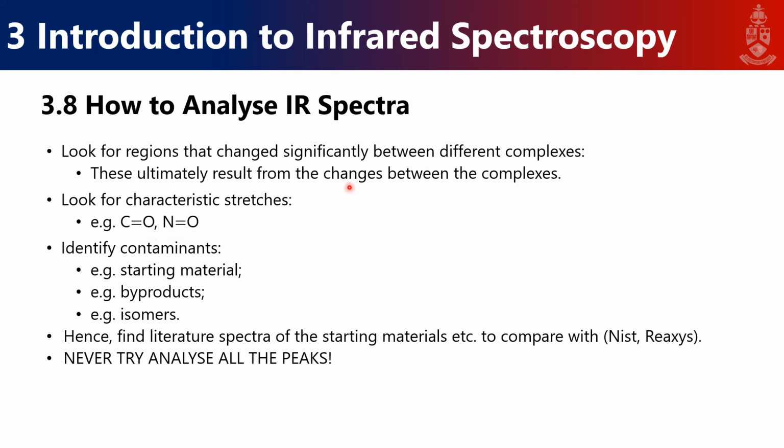You're looking for the differences, which you can explain. And really, by the point when you've started explaining and you have about 4 or 5 peaks identified and explained and really rationalized, I mean, you can stop. That's the point. We'll go into more detail in the post-practical lecture of how to analyze an IR spectrum.